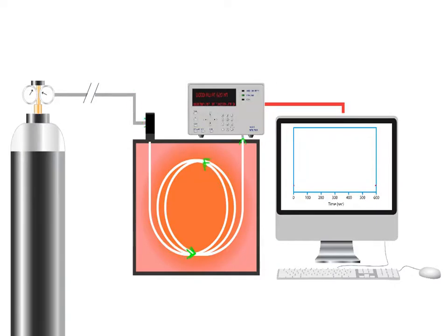With gas chromatography, the mobile phase is a gas, and this flows at a constant flow rate through a column containing the stationary phase. The column can be a piece of glass or stainless steel coiled tubing filled with a loose powdery material which forms the stationary phase. In order for samples to be separated under gas chromatography, they must be in the gaseous phase, and so the column is placed in a thermostatically controlled oven to keep the substances of interest gaseous.